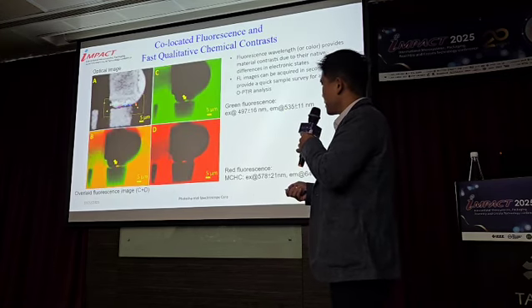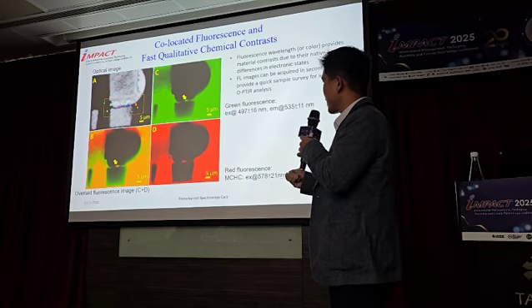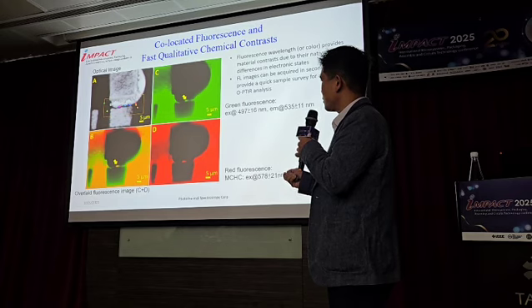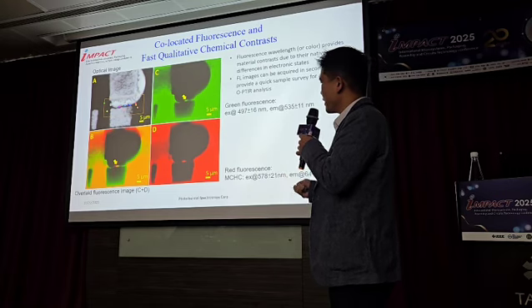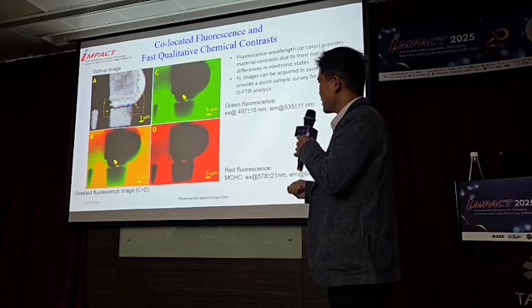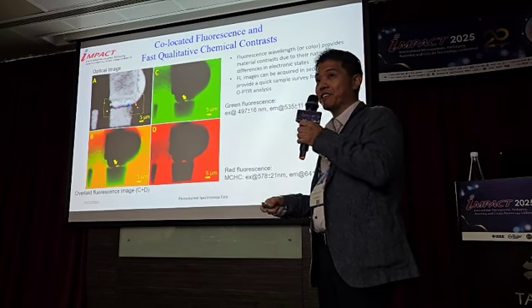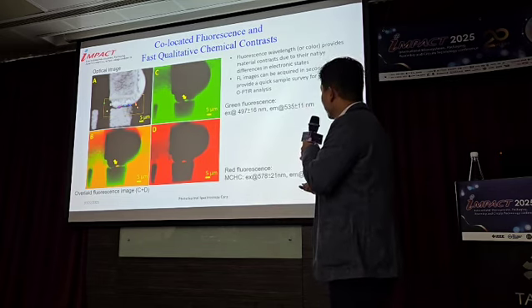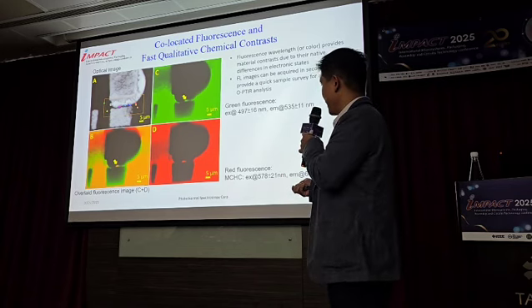And so, as an example, we have contamination settling on the surface of the copper here. It blocks the solder from joining to it. Using fluorescence imaging, we can quickly identify where the region of interest may be, and we can clearly see that this area is fluorescing. And it does have a different color hue, so that actually tells us that it may have at least two different kinds of chemicals present.